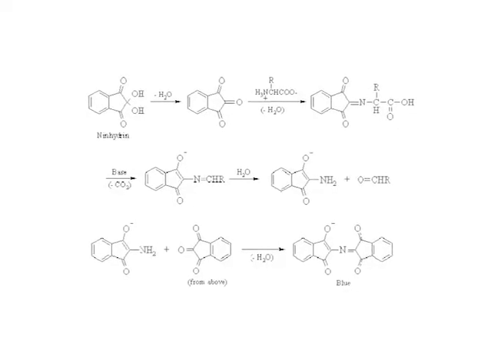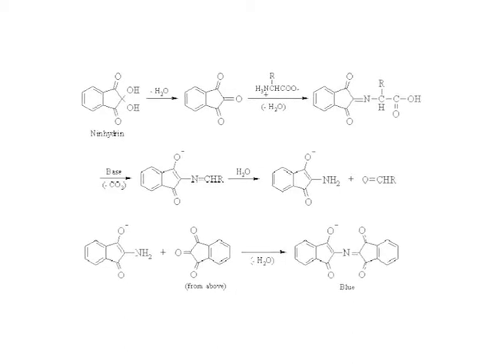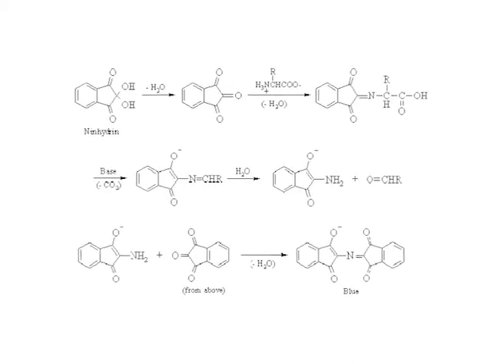Till the early 1980s, it was endeavored to improve the Ninhydrin method by altering the solvents, the composition, or by pre-treatment or post-treatment of developed prints. Later, a different approach was adopted. Several derivatives of Ninhydrin were synthesized and tried out for developing latent fingerprints.